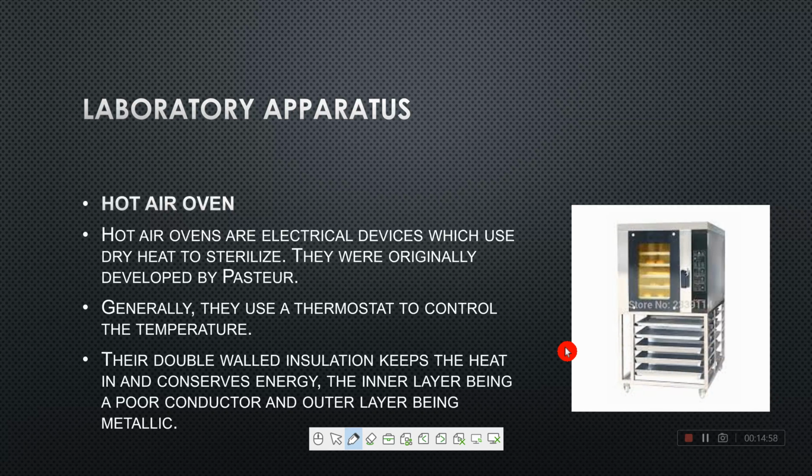The two types of sterilization are, first, dry heat sterilization and second, moist heat sterilization. To disinfect and sterilize glass or glass tubes or glass equipment, the hot air oven is used. Whatever equipment we are using in the laboratory needs to be sterilized before performing other tests, and this occurs with the help of a hot air oven.